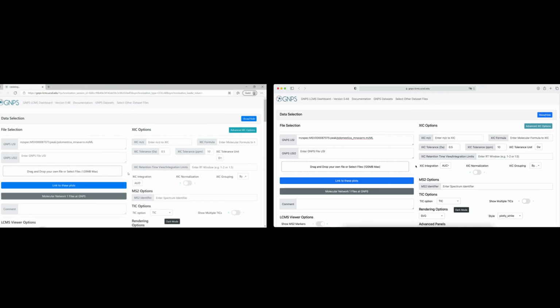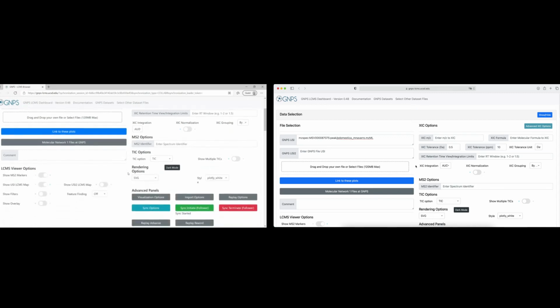Now that the file has loaded, we can show how powerful the fully collaborative mode is. In essence, what one party does is shown in the other party's screen and vice versa, so that both parties can actively participate in the data examination.